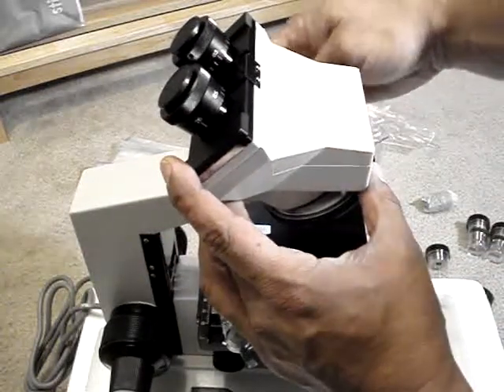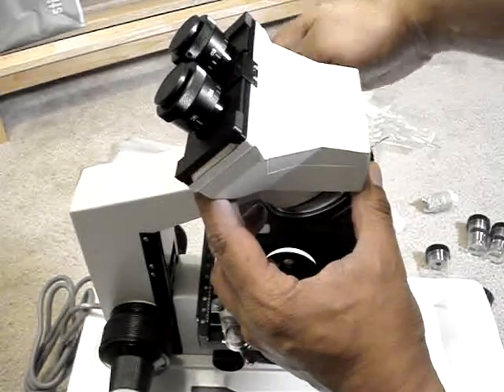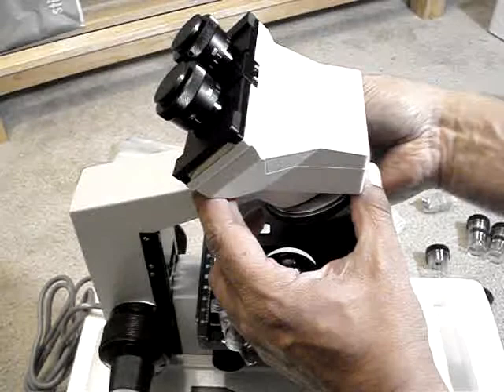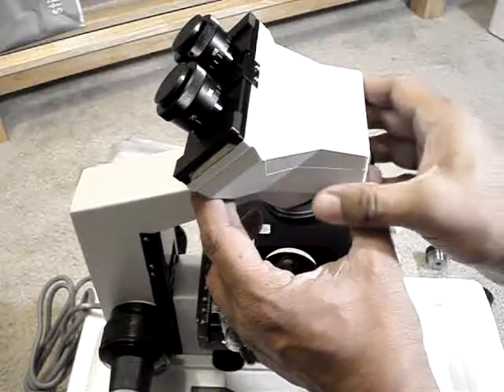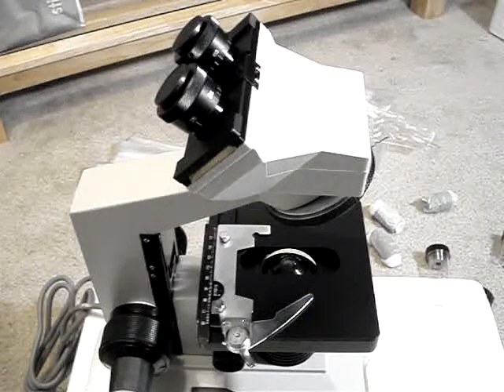This particular microscope is relatively simple to assemble. You have the dual eyepieces on the top of the microscope, and basically once it's seated in, you would just screw it into place.